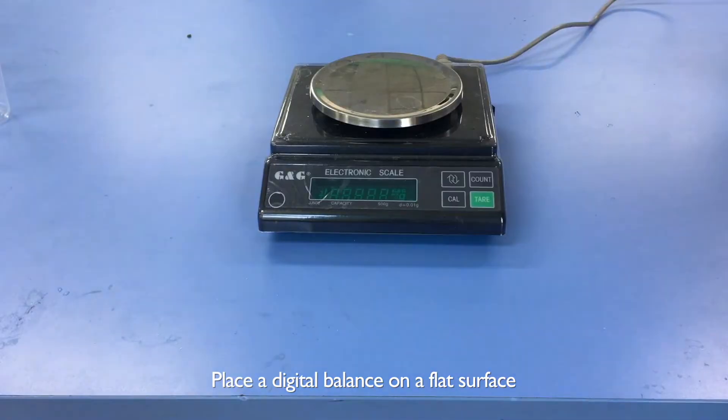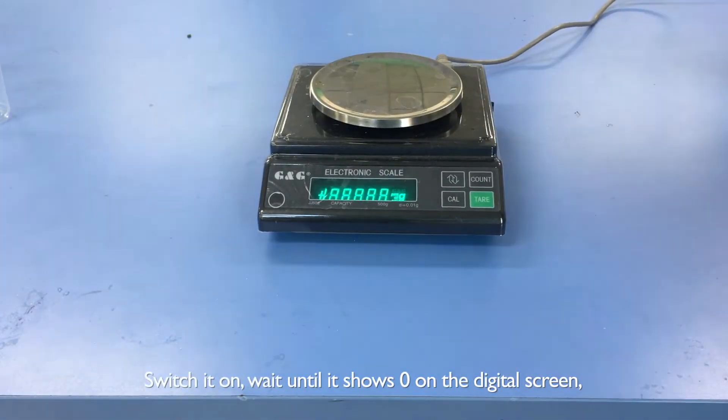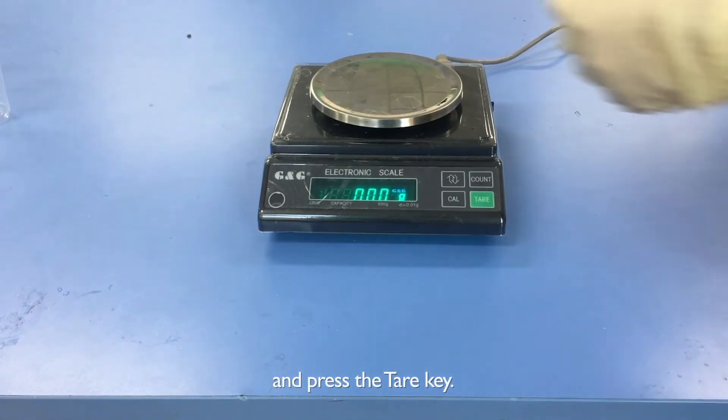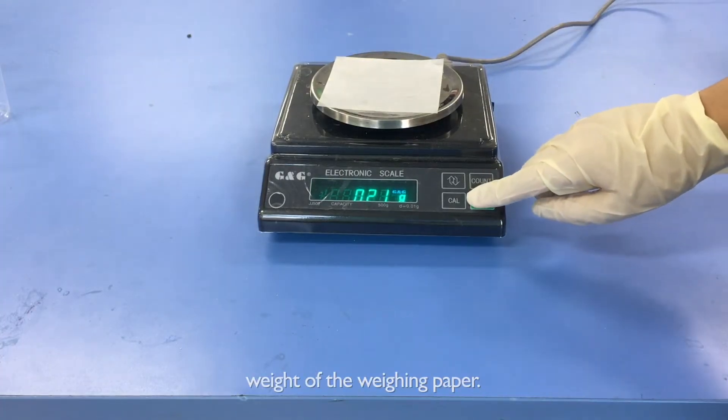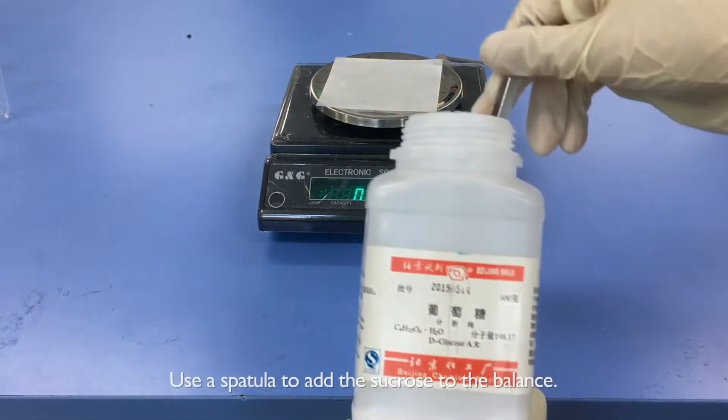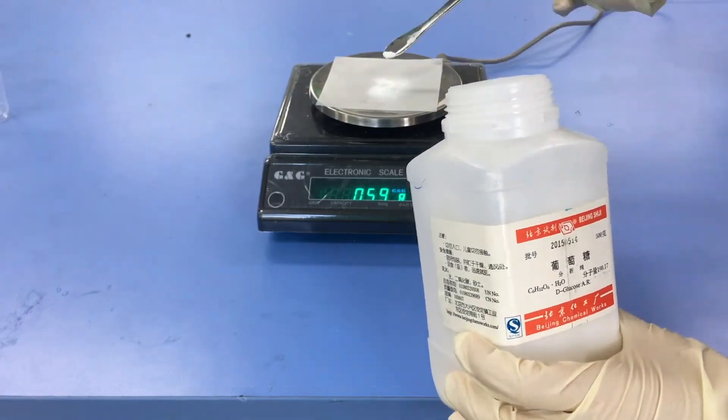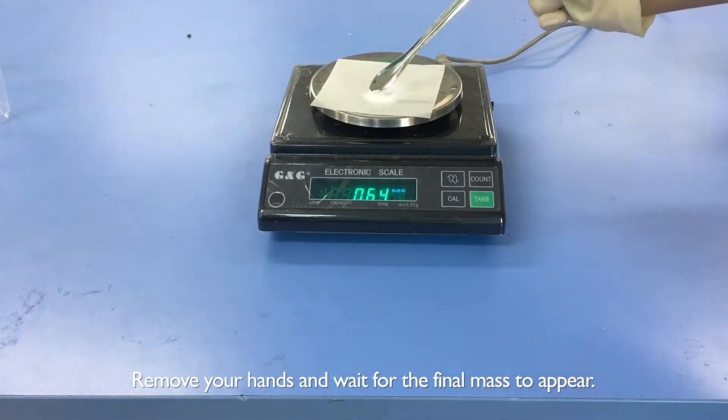Place a balance on a flat surface in order to measure the sucrose accurately. Switch it on, wait until it shows zeros on the digital screen, and press the tare key. Put the weighing paper on the balance and press the tare key again to deduct the weight of the weighing paper. Use a spatula to add the sucrose to the balance. Remove your hands and wait for the final mass to appear.